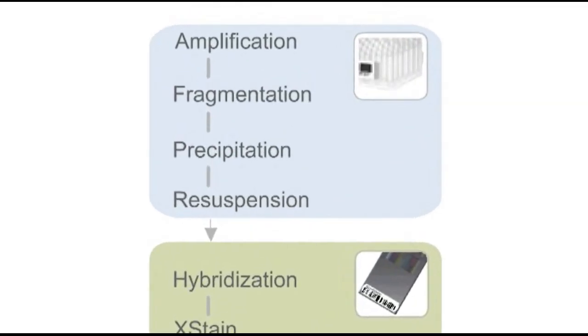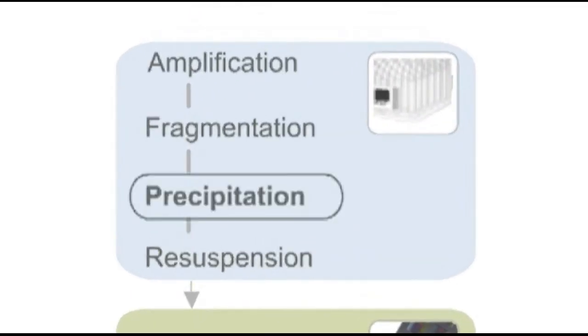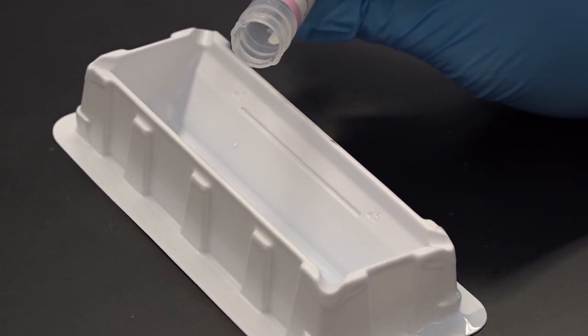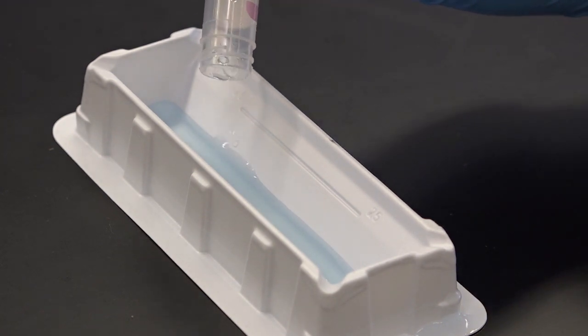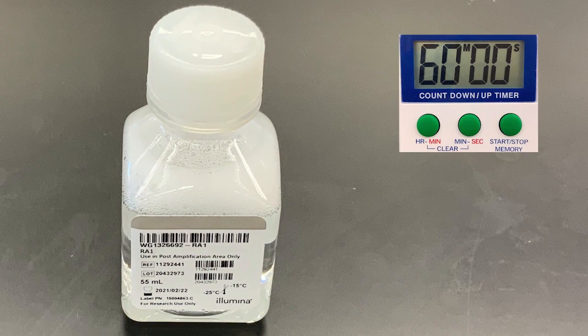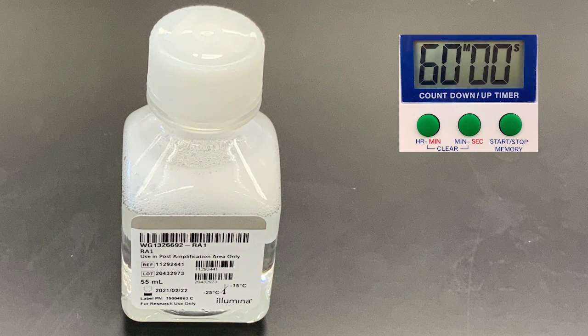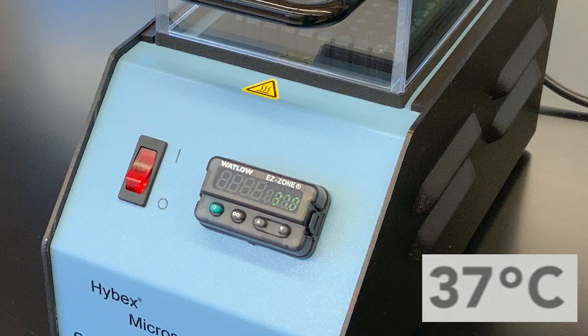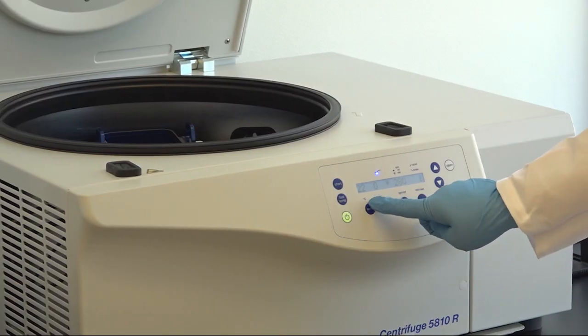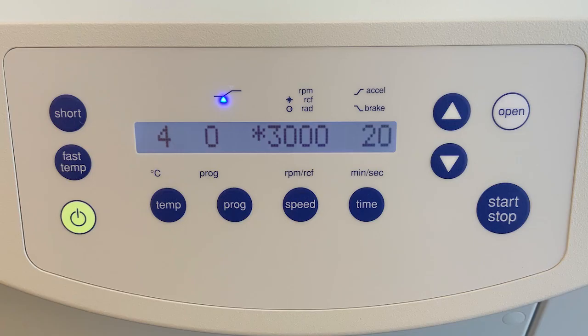The next step in the Infinium assay is precipitation. Remove the precipitation reagent from four degrees Celsius and allow to equilibrate to room temperature. Also at this time, remove the resuspension reagent from the freezer to allow it at least one hour to thaw. Set the heat block to 37 degrees Celsius and set the centrifuge at four degrees Celsius.